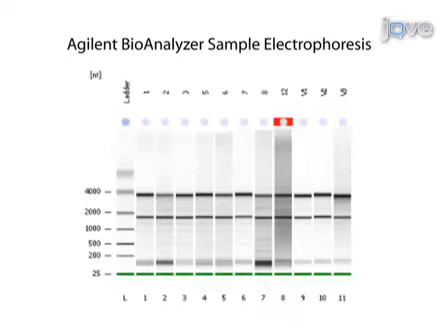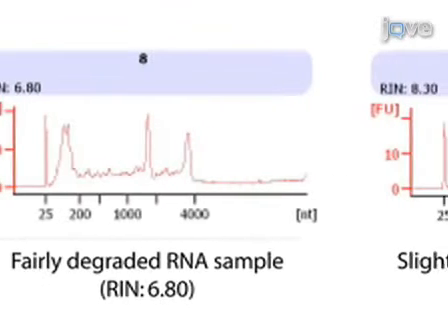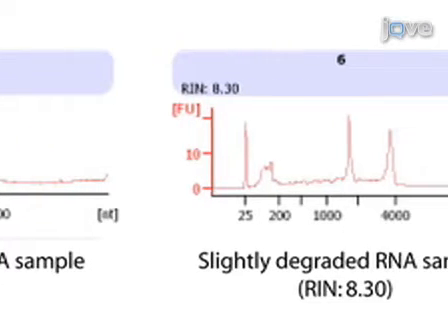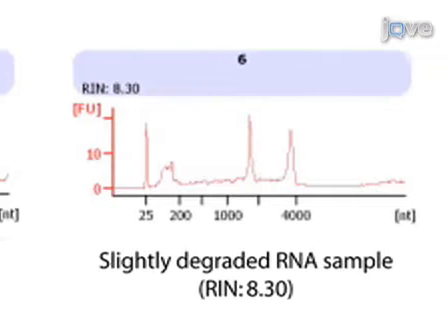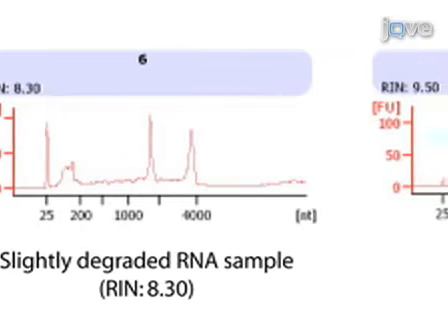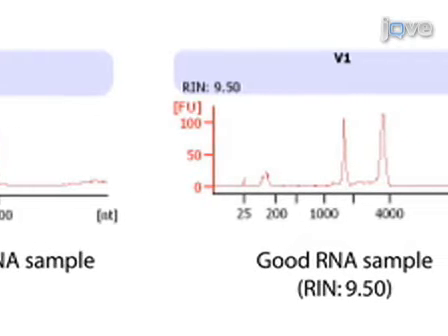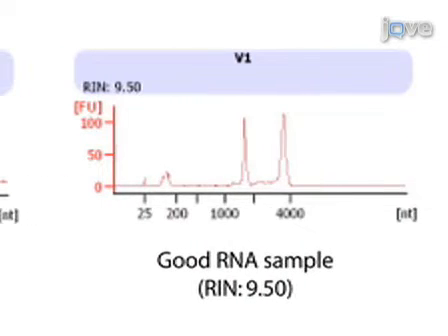You can check the RNA quality if you desire by using an Agilent bioanalyzer or by running the sample on a denaturing gel and checking the OD readings. On the bioanalyzer, good RNA quality is indicated by the RNA integrity number, or RIN. The RIN is based on a numbering system from 1 to 10, with 1 being the most degraded profile and 10 being the most intact.